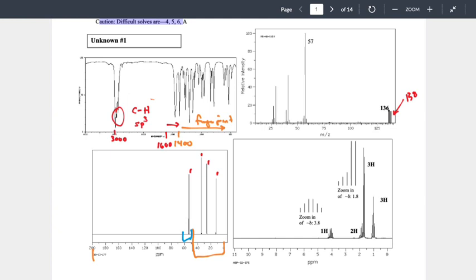We could go through and call our types of carbon now. We could say that there's 3 times alkanes. And if we looked at the chart, which I'd taken away, we would say 1 times, I don't know, that was in a space that wasn't labeled. That space that wasn't labeled is everything else. Tons of stuff can happen in there, depending on the immediate local environment. So we could call that a question mark.